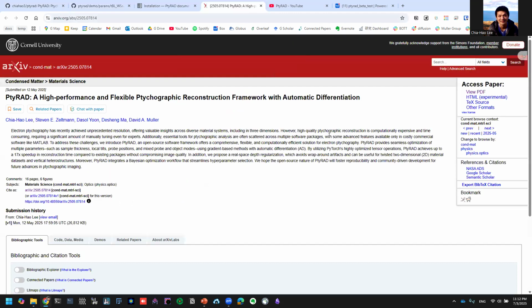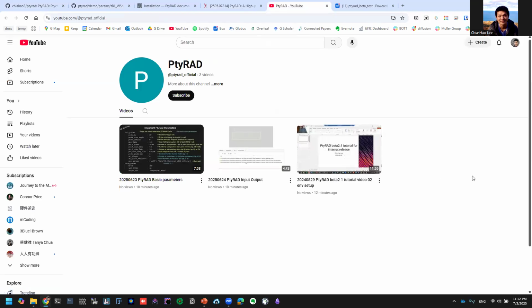And if you want to know more about PtyRAD on the theoretical side, there is an arXiv paper we put out. There you can see more discussion about the figures and the benchmarking that I just showed you in the video. And lastly, we're still making more videos, including this one, and we're going to put them on YouTube so that everyone can see them.